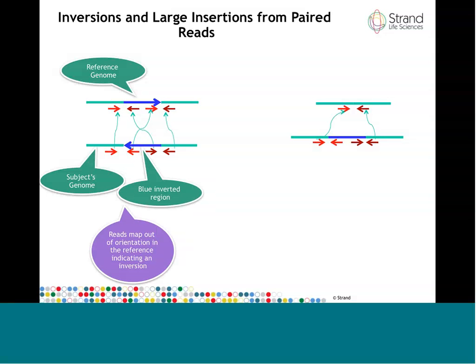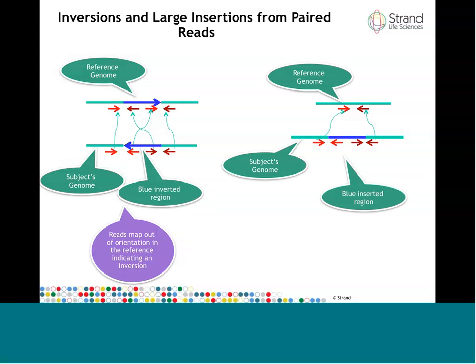So the reads map out of orientation and further away from each other, indicating an inversion. Likewise, you can find large insertions. In a large insertion in the subject, there's a big region that's inserted.